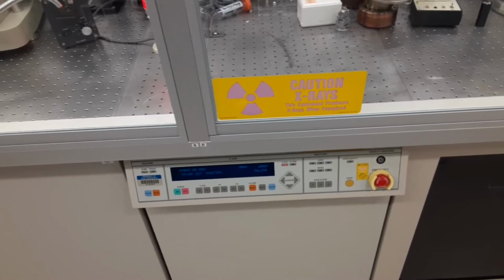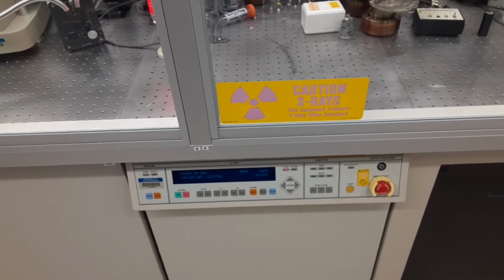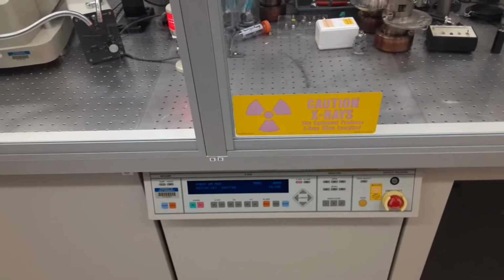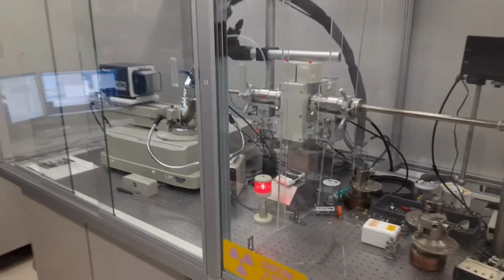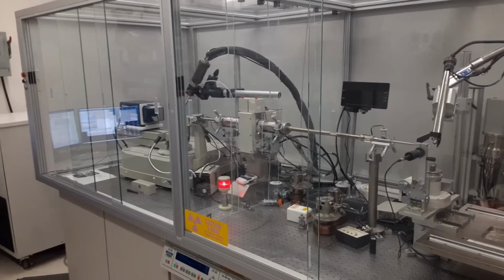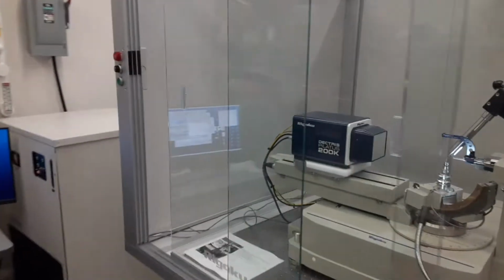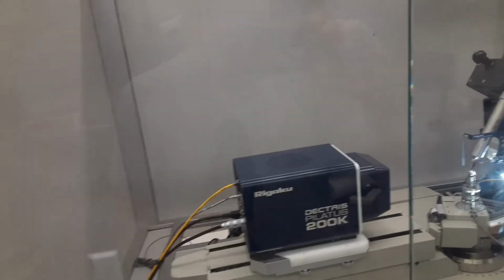Okay, so we have to discuss radiation safety. The system produces X-rays, which are a form of radiation which can be hazardous in certain situations. We have several safeguards in place to protect users from unnecessary exposure to radiation. The first is that the entire system is enclosed in a large glass and metal box. And the glass is a type of glass that is not X-ray transparent. The second safeguard is that during the experiment there are doors that slide, and those doors need to be shut.